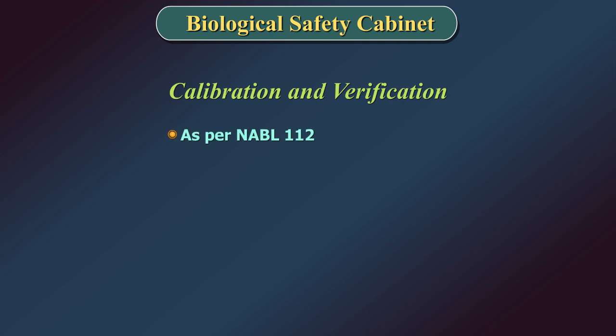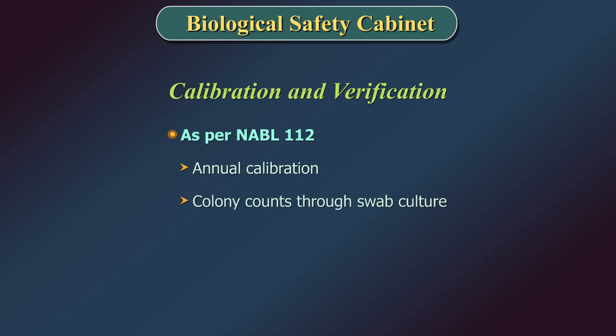As per NABL 112, in addition to annual calibration, colony counts through swab culture need to be done and documented at least once a week.